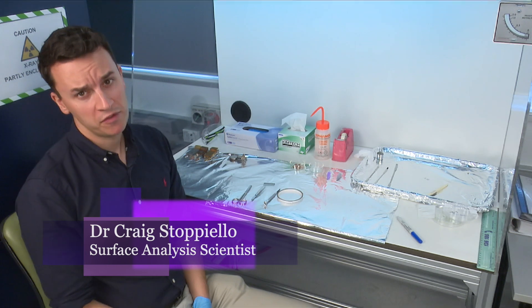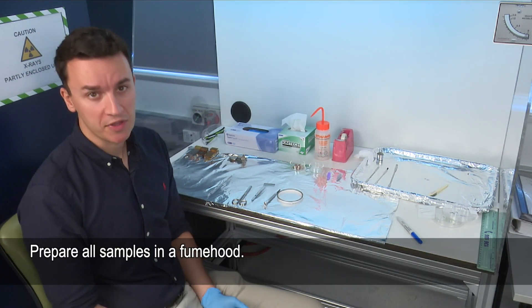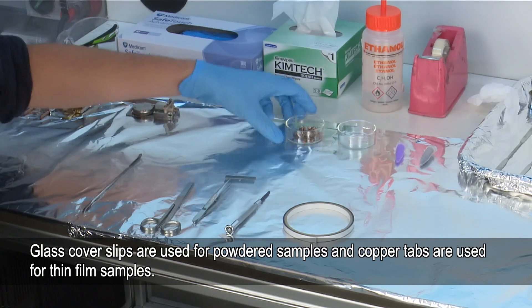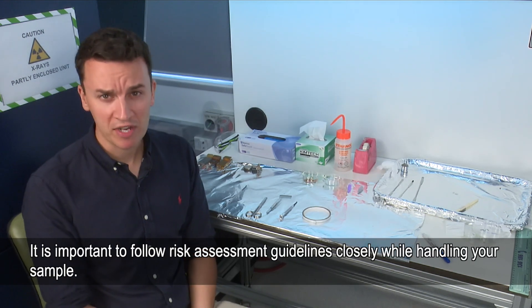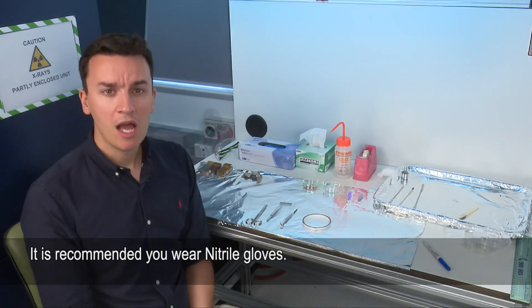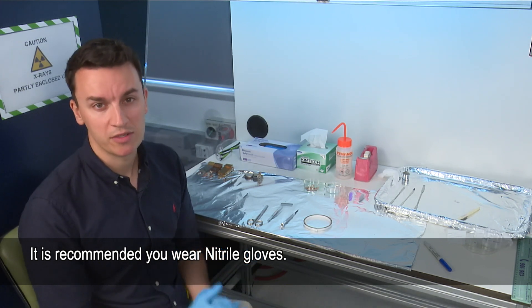This is the sample preparation fume hood. This is where we prepare all the samples — we add the powders or the solids onto the sample holders. These are the tools that you'll need: spatula, scissors, tweezers, screwdriver, and the carbon tape. For powder samples we use glass cover slips, and for films we can use copper tabs. It's important to adhere to your risk assessment, so if it requires safety goggles make sure you wear them. You should always wear gloves because the sample holders are sensitive to human contact.